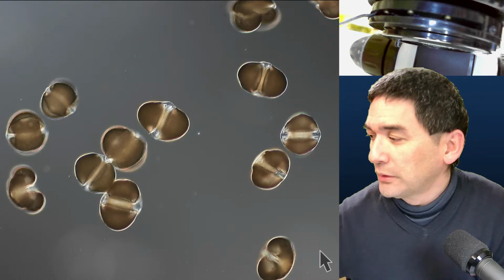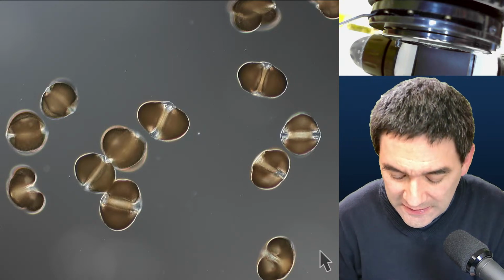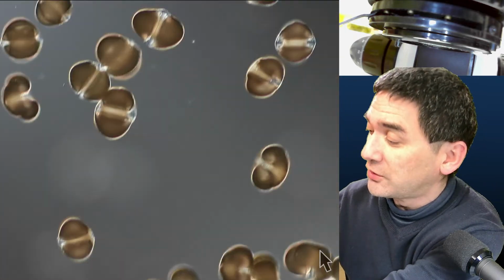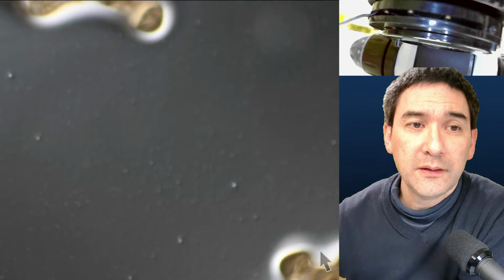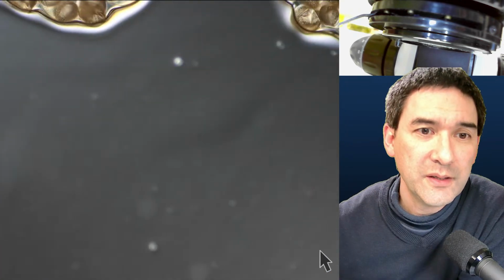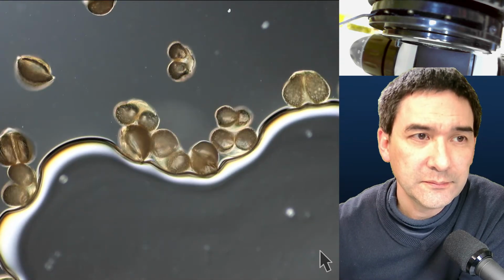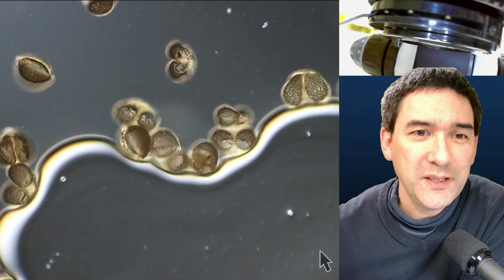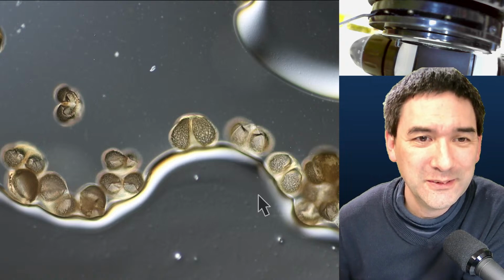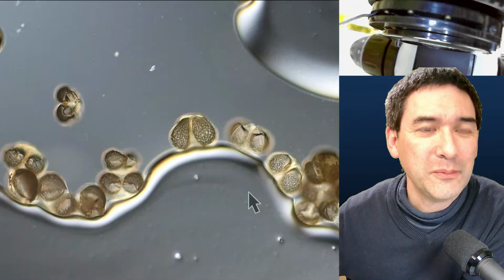And the last one that I would like to show you is, I would say, maybe the least suitable one. That is clear nail polish, and I say least suitable because there are lots of bubbles. And as the nail polish dries, it starts to shrink quite a bit. What we have here on the side, you see actually that's the bubble, and over here on the side you've got the pollen grains. But interesting here, with this one you're able to see the surface texture of the pollen much better. So we can again play around a little bit.